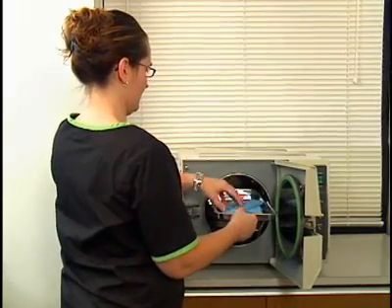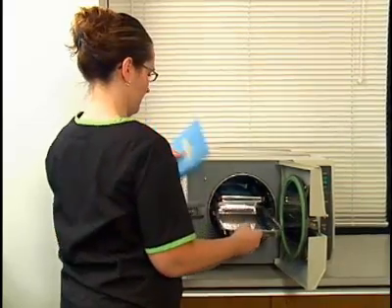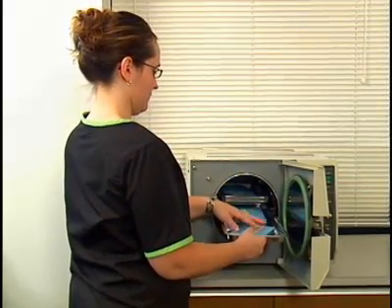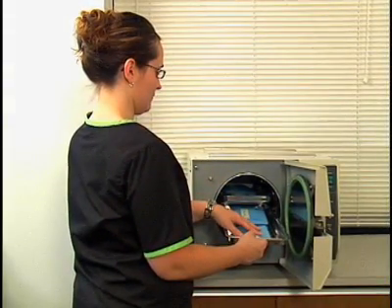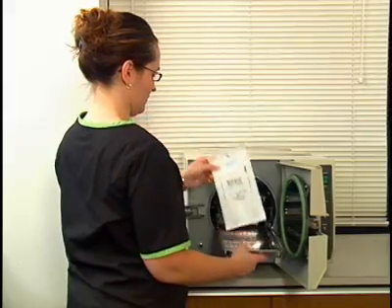Properly load the autoclave to ensure adequate steam penetration of all articles. Avoid overloading. Small packs should be placed 1 to 3 inches apart, and large packs should be placed 2 to 4 inches apart. The packs should not touch the chamber walls. Be sure that at least 1 inch separates the autoclave trays.